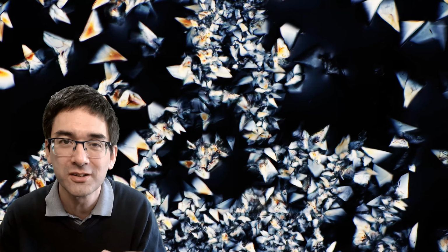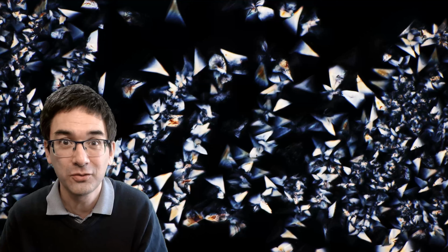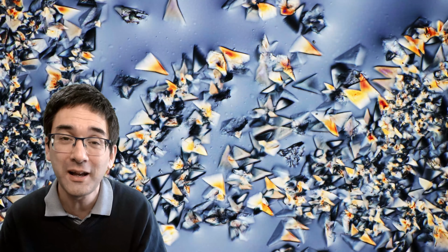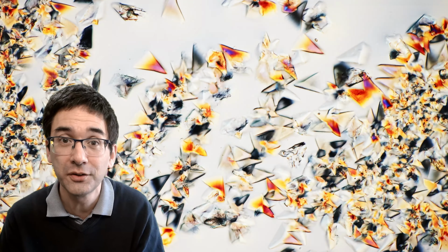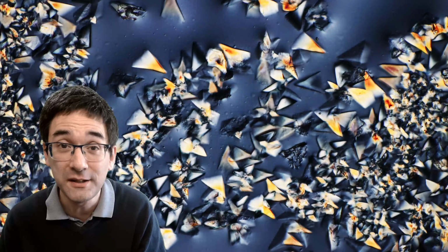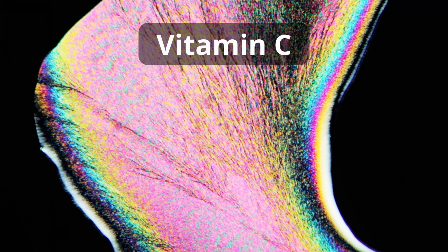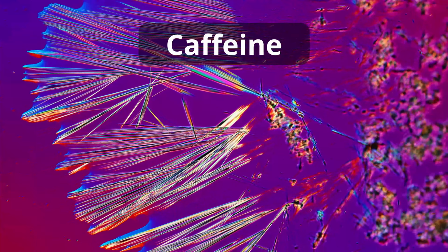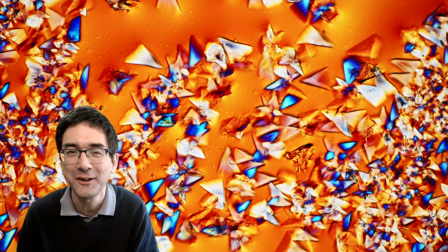And this is where the crystals are able to grow. Well, still, the crystallization process was not that perfect, because I only had those nice crystals forming where I actually touched it. I've also tried other specimens like vitamin C, for example, very beautiful. And once the crystallization starts, then the crystallization spreads over the whole slide. But not here with Coke, unfortunately. But it doesn't really matter, because I think that they look very nice anyway.